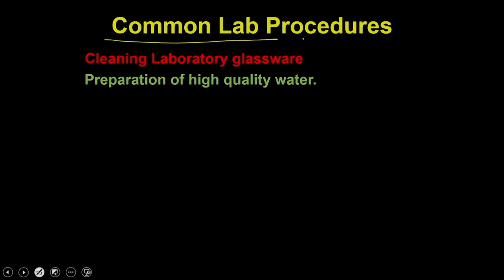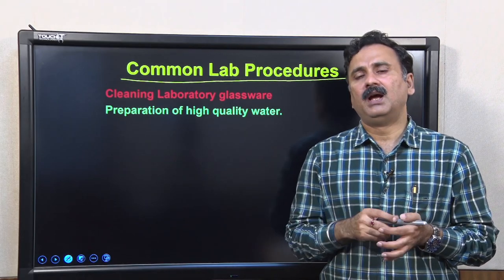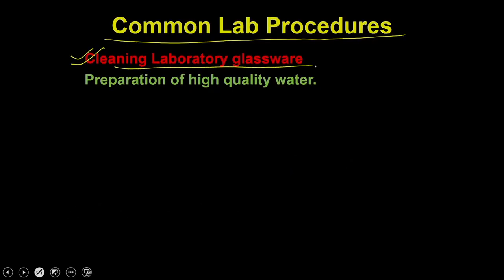So far what we have discussed is the common lab instruments, now we'll discuss the common lab procedures. What we are going to discuss are two procedures: cleaning the laboratory glasswares as well as the preparation of high quality water.